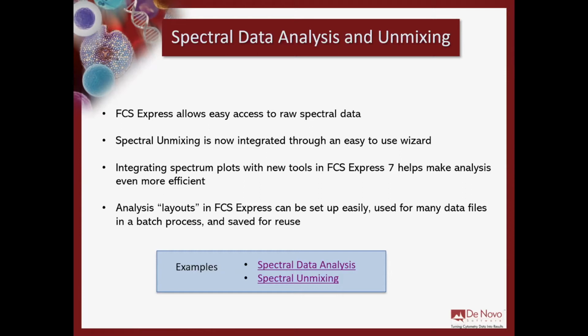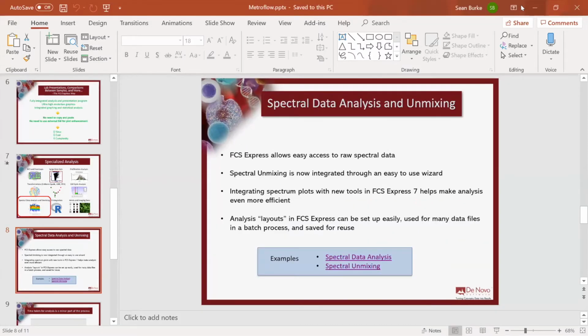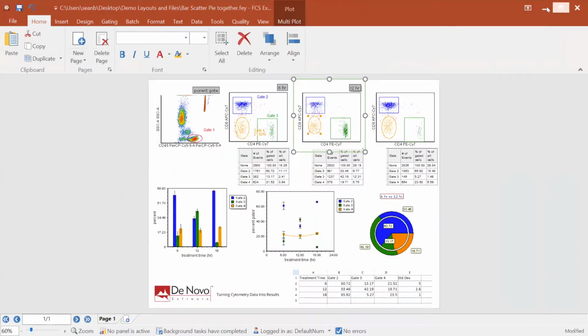And what you're going to see is, again, you can use these analysis layouts over and over again, so you don't have to recreate the wheel every time you're performing an analysis. So I want to show you what it looks like here. Let me get out of my presentation mode, and we'll come back over to FCS Express.